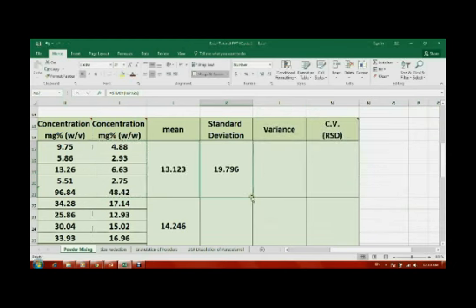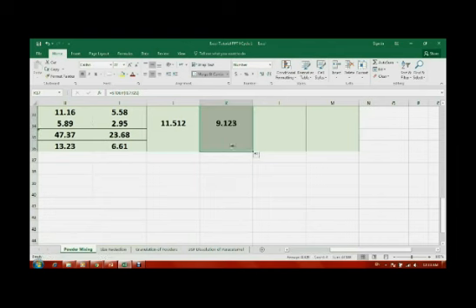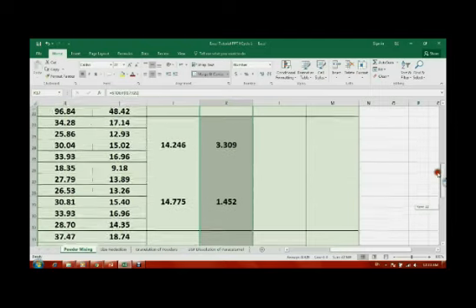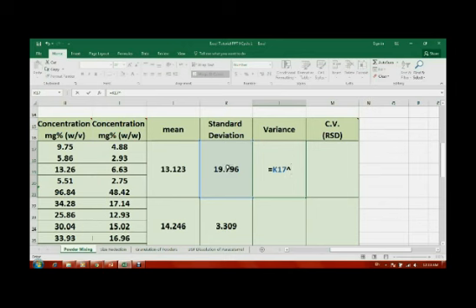For example, if our sample was dissolved into up to 200 ml distilled water, we need to calculate the amount of sample in 100 ml distilled water, then use it to calculate the concentration milligram percent weight per weight.